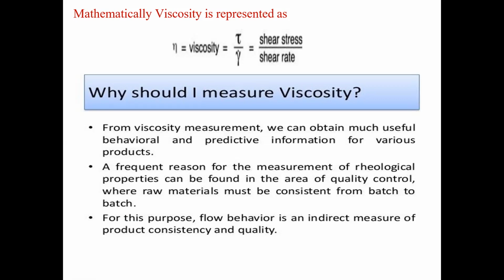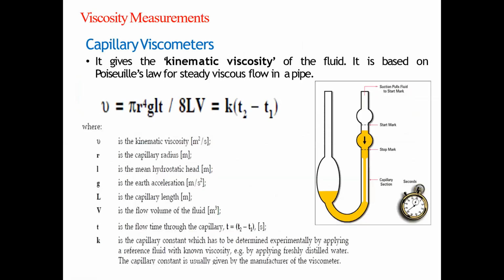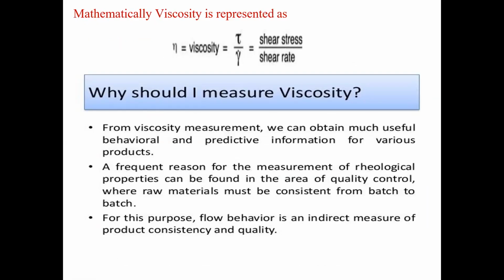A frequent reason for the measurement of rheological properties is in the area of quality control, where raw materials must be consistent from batch to batch. For this purpose, the flow behavior is an indirect measure of product consistency, and that is the reason we measure viscosity.